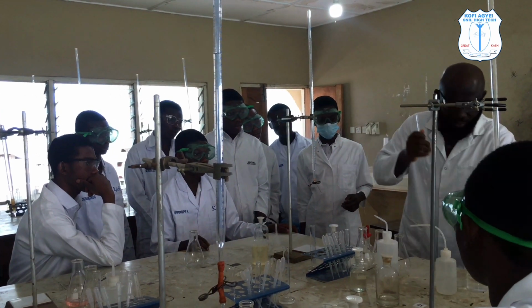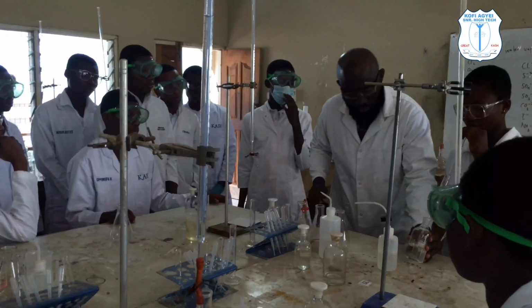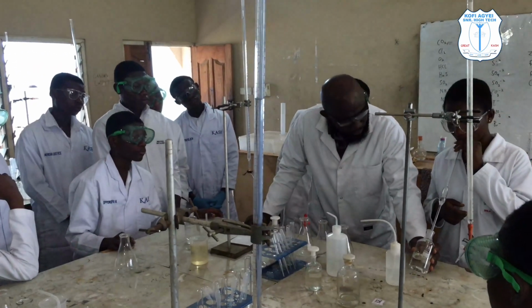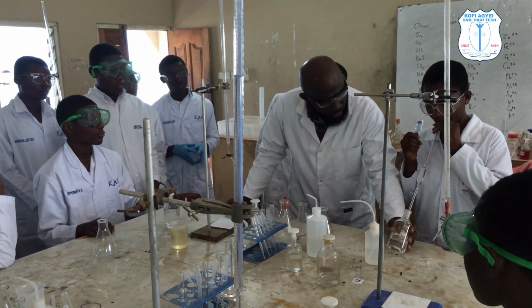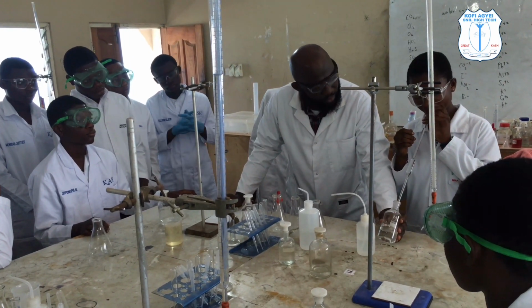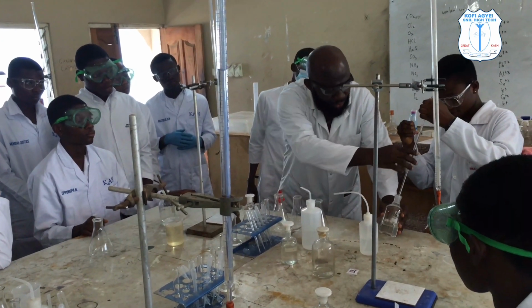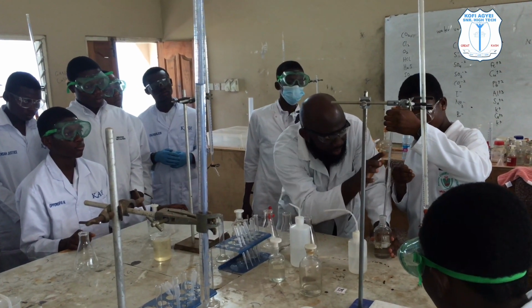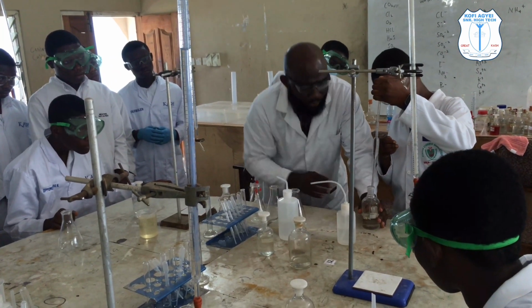So sister, please come around. Gently. So take your time, okay? Now withdraw. Apply your thumb. Now the thumb, you straighten it nicely. Adjust to the mark. Adjust gently to the mark. Take your time. So do it again.